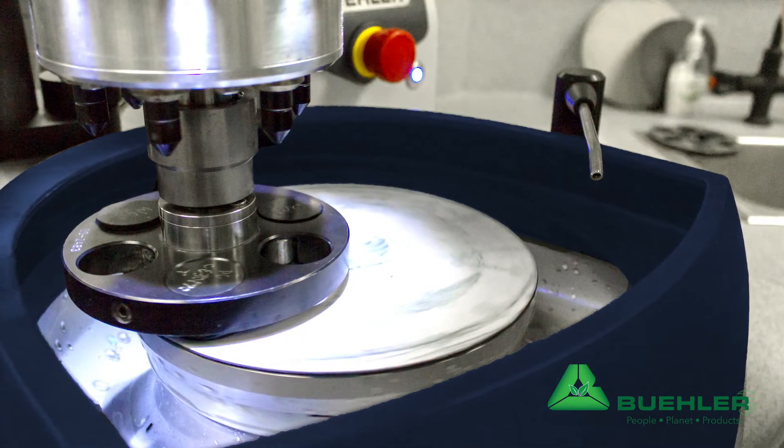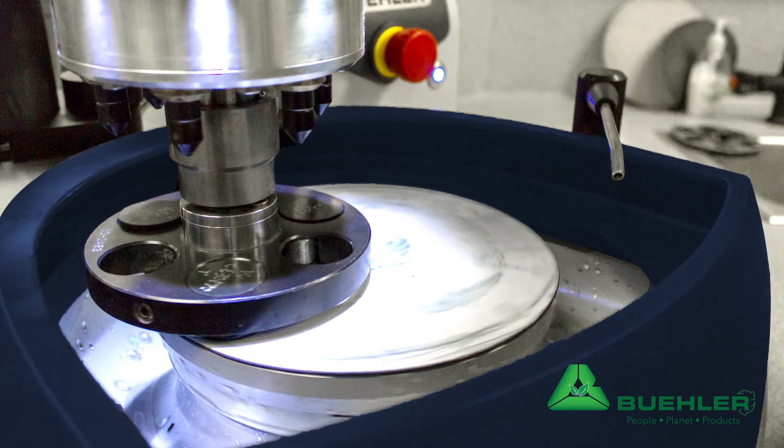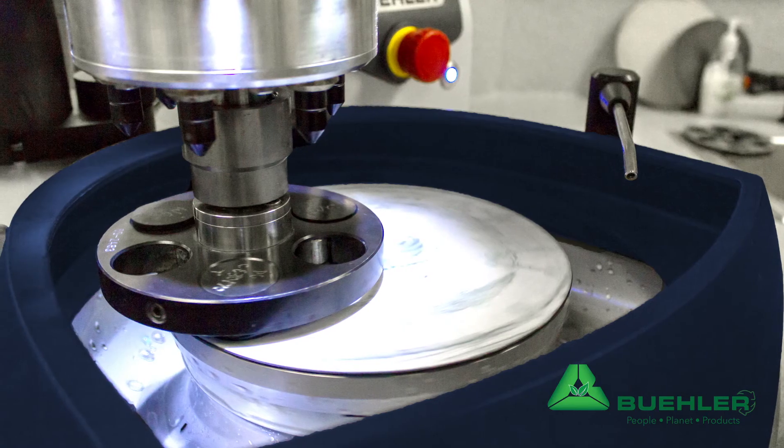In addition, you can prepare your samples faster. Properly used, you can expect to need half as much MetaDi Supreme or Ultra diamond compared with inferior abrasives.